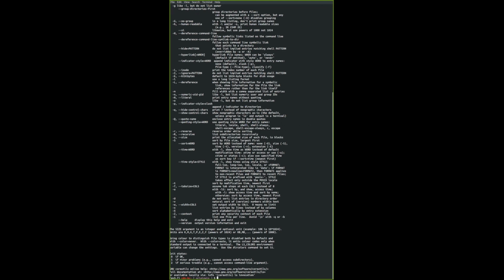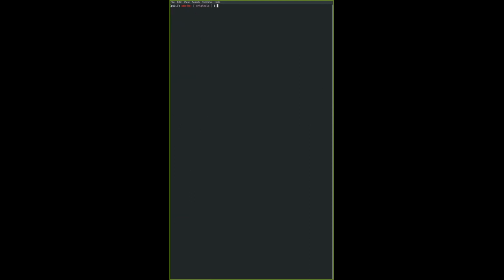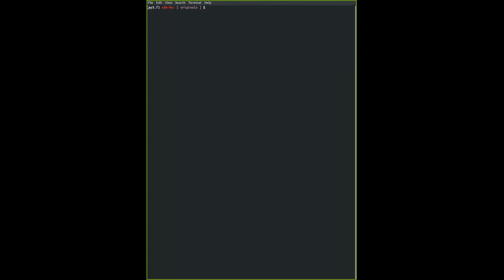Because some of the commands may print out very long lists of lines, we also learn how to clear our screen using the function clear. So I'm going to bring up my terminal a little bit so that you don't get to see code too far towards the bottom. So clear will clear the whole screen and give you a fresh page for you to begin inputting your commands.